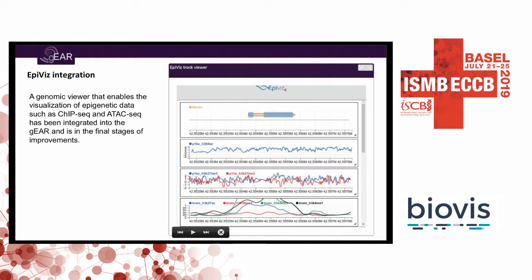We've also started adding integration with EpiViz so that you can view things like ChIP-Seq and ATAC-Seq. That can be one of your datasets in a box for context.